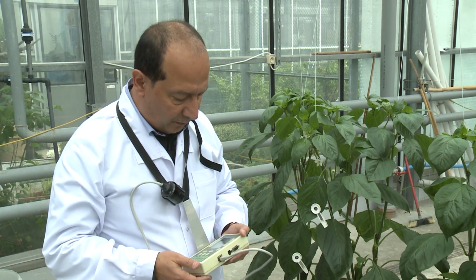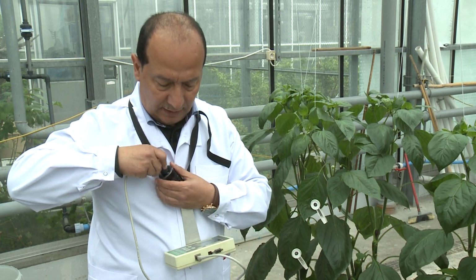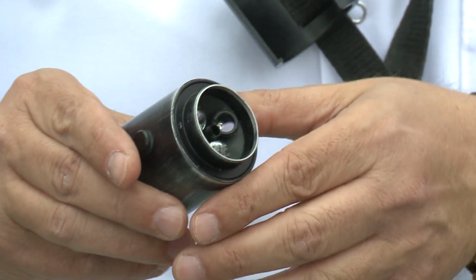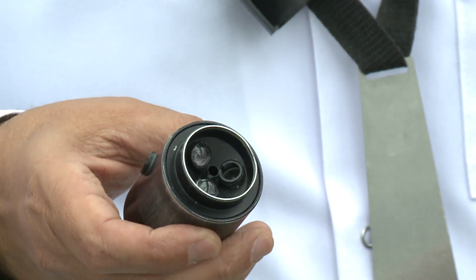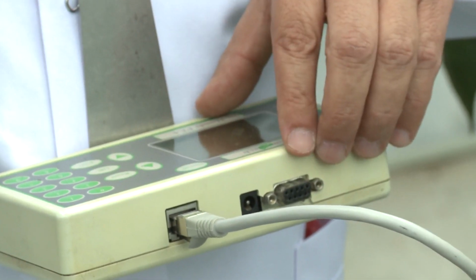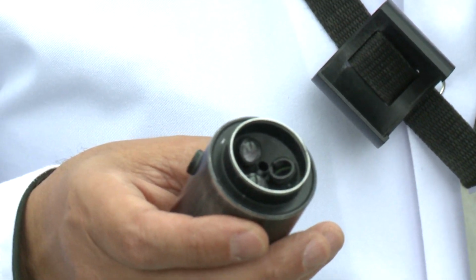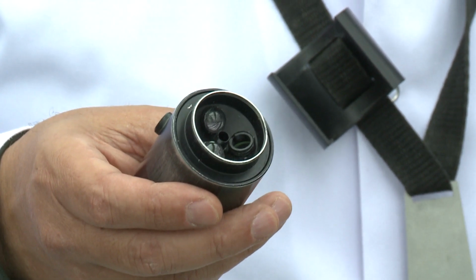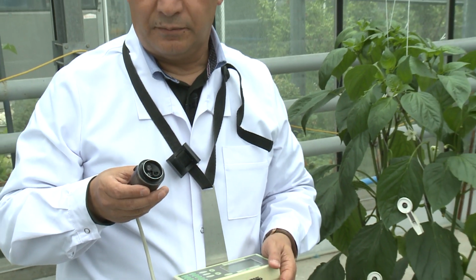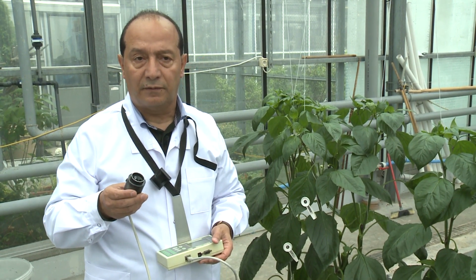And this is an example from the Hansatech company, which comes as the main fluorimeters with head sensors that allow us to give a light intensity for excitation of the chlorophyll, and then we can measure back the signal, which we call chlorophyll fluorescence. Here we have the firmware and the software, and we establish our parameters: how much light intensity, what is the duration of the excitation, and how many repetitions we would like to have. Usually this type of measurement takes about 1 second, and in 1 second we will have more than 120 points on the curve, which we call the chlorophyll fluorescence induction curve, and we will have more than 70 parameters related to photosynthesis and photosynthetic efficiency of the plants.